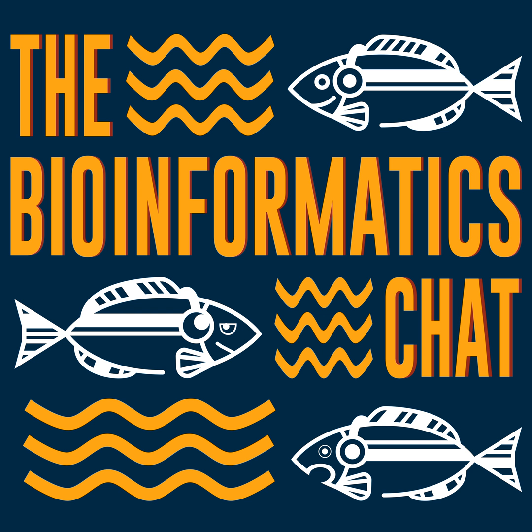Exactly. Okay, and so you compared your tool with the other assemblers in terms of NG50 and NGA50. What did you find? So we found that Flye typically, on many genomes, consistently performs equally well, and sometimes better, on various genomes that we were benchmarking, such as yeast genomes or the C. elegans genome.